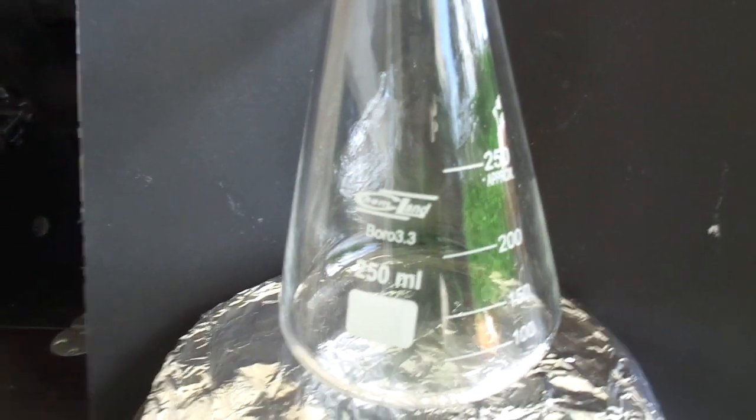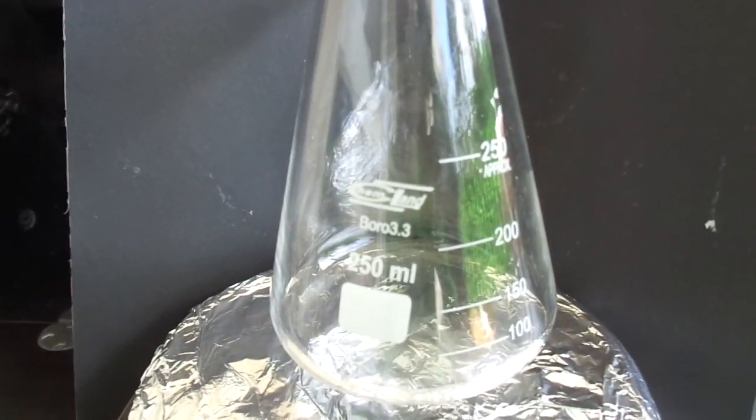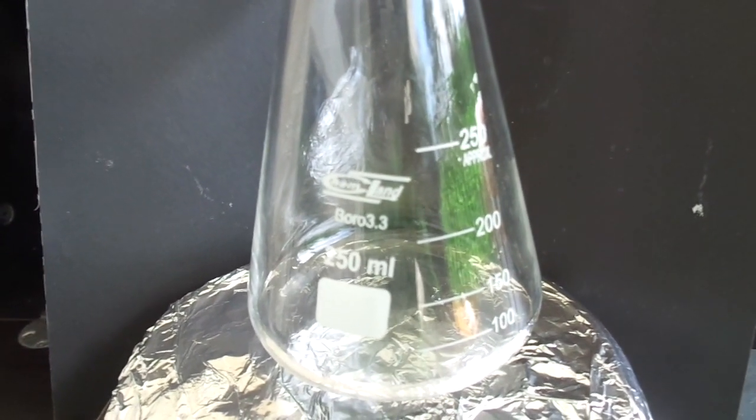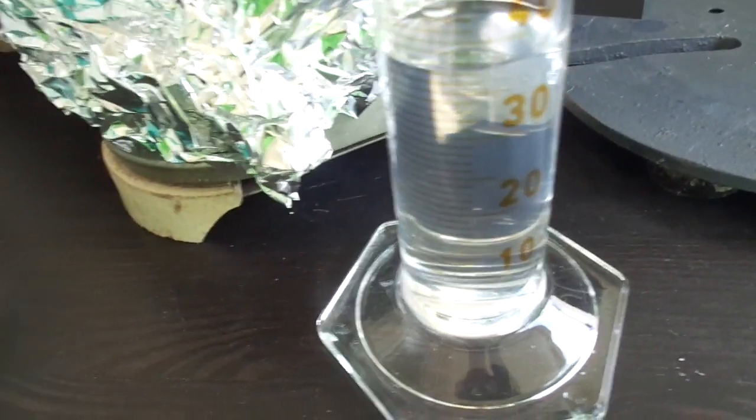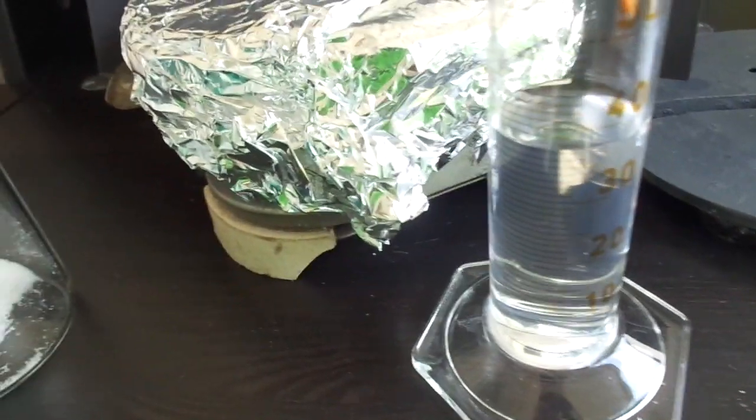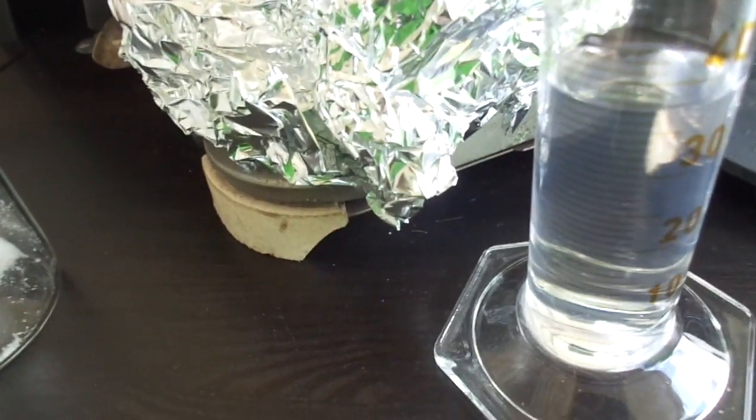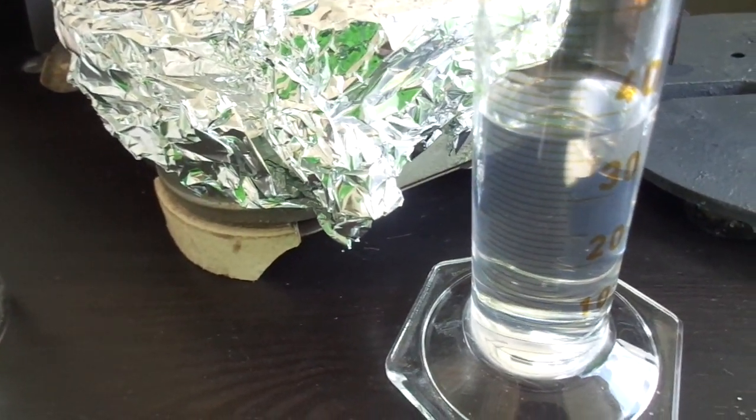Hello, in this video I'm going to make some triethyl citrate which is supposedly an ester with a nice smell. I have about 37 ml of ethanol and 28 g of citric acid. Ethanol is in excess because it's also going to be a solvent.